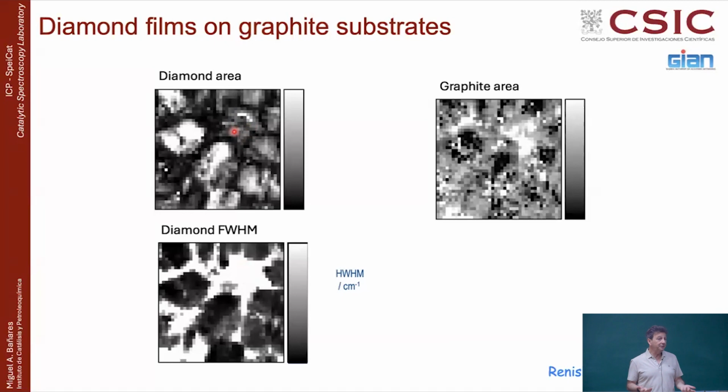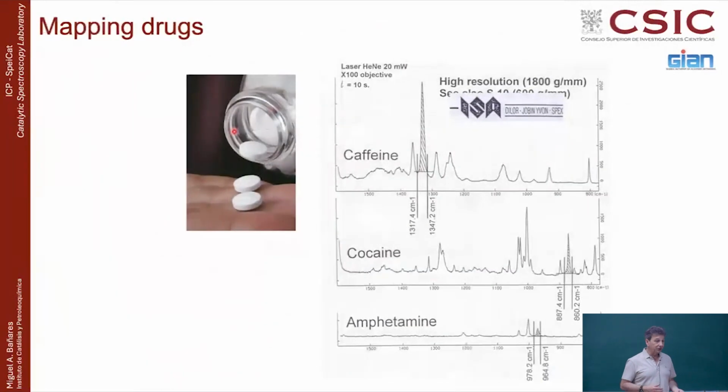Basically, you can plot anything out of your spectra. You can plot the relative intensity of one spectrum to the other. You can plot the absolute area. You can plot the peak width, and this will give you a lot of information. Or you can also monitor the distribution.